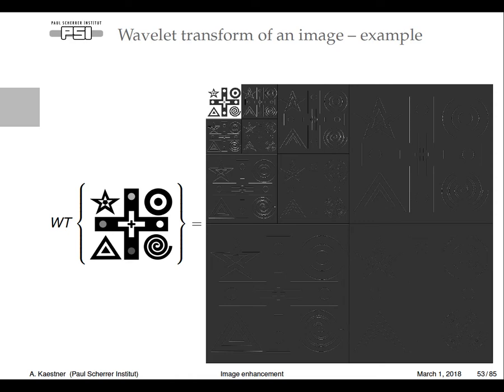The trend doesn't need to be saved between the steps, so that one is only on the fully reduced scale. And here you can also see again, here you have horizontal information. Well, it's a bit hard to see the diagonal, but you start seeing them in these two. Here you have the vertical information.